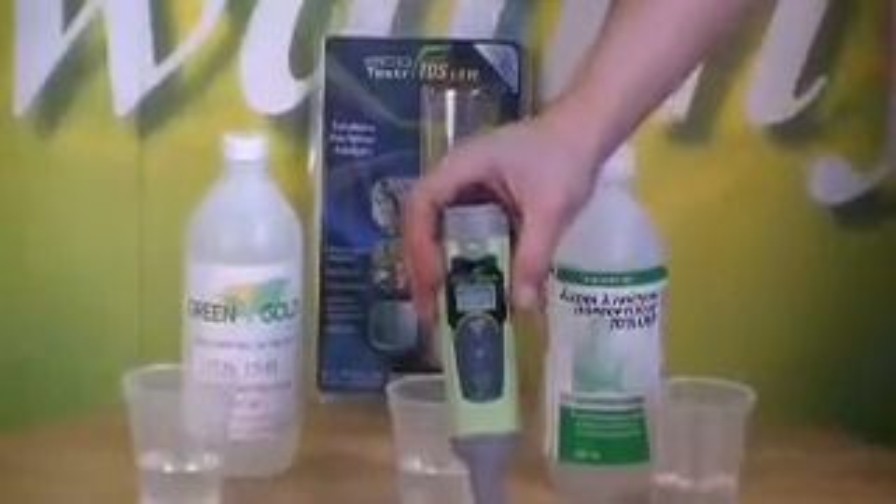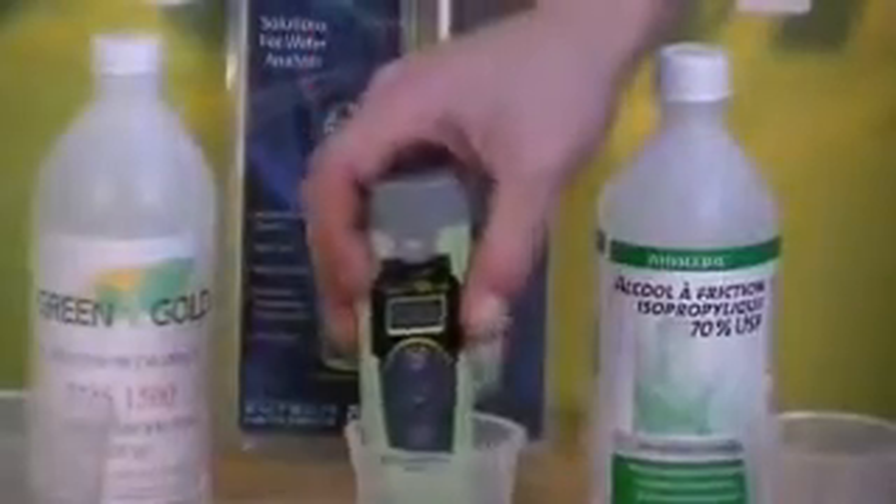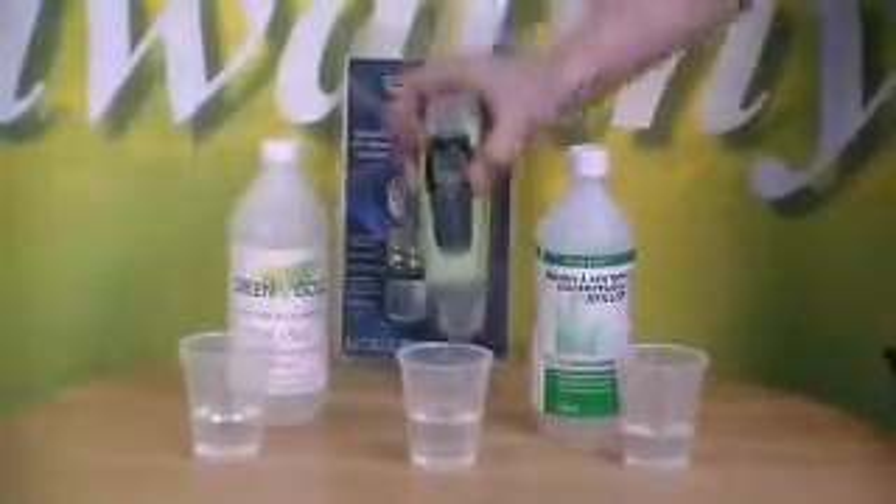After you're done putting it in the alcohol for 5 minutes, you rinse it in your water for about 2 minutes by stirring it around like this. After that, make sure all the water is off of it — just shake it a bit like this.